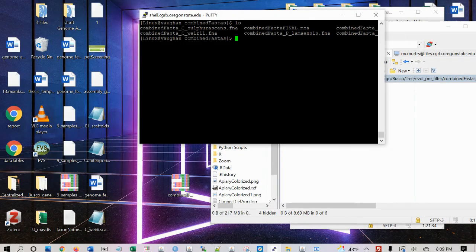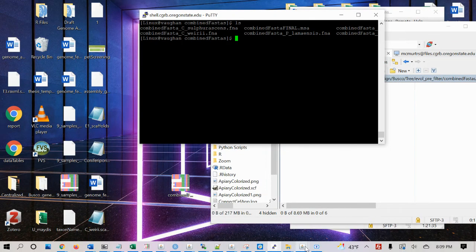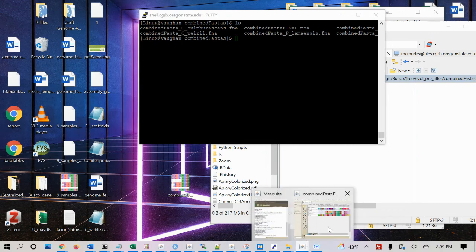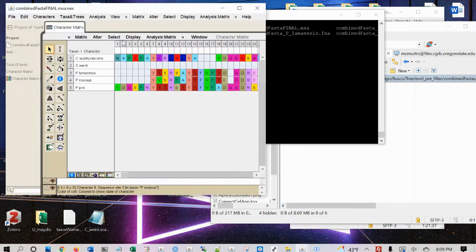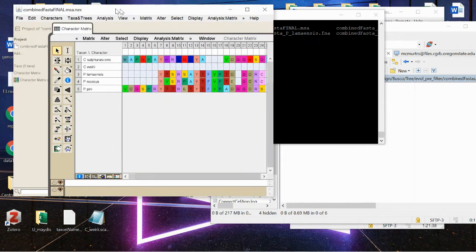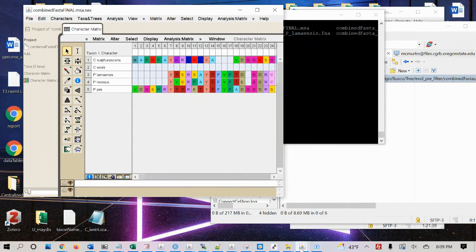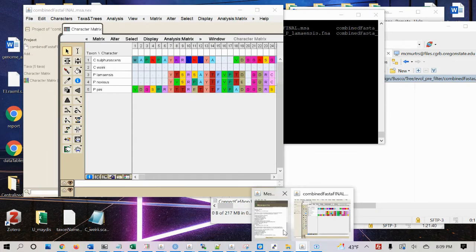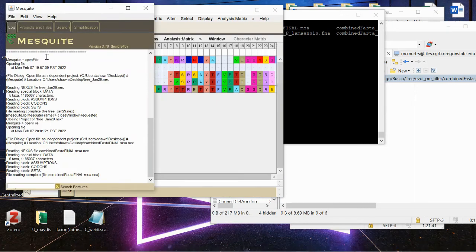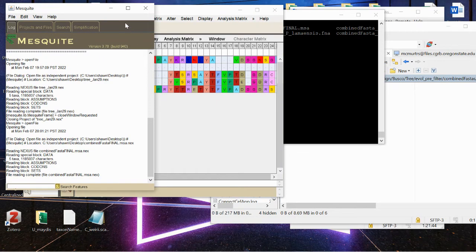there's this handy program called Mesquite. Here, I'm using Mesquite, let's see, version 3.7.